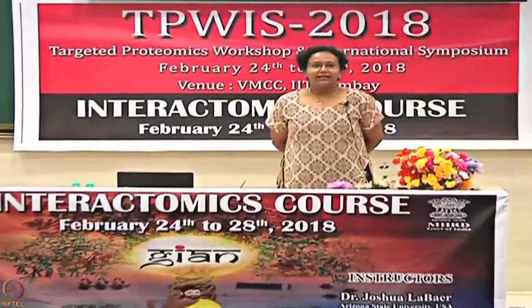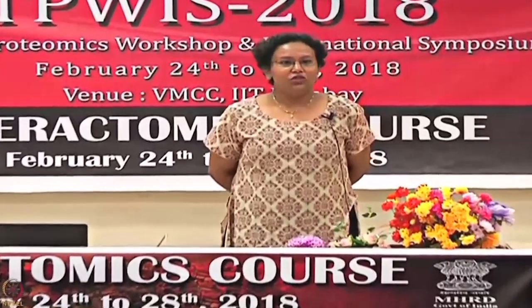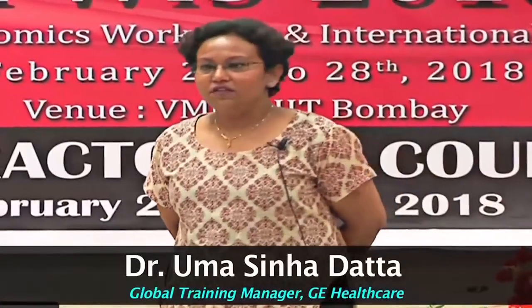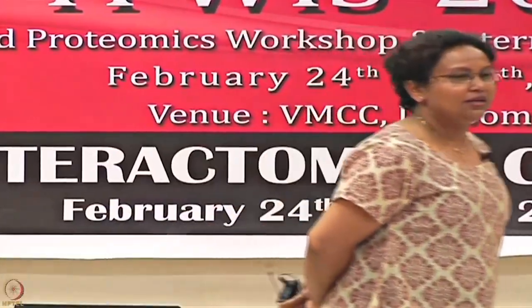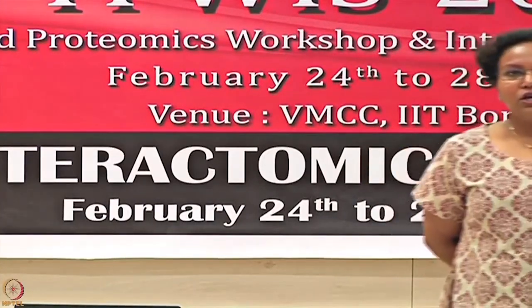So, you all had a chance to look at the Biacore. We talked about some of the SPR technologies, how it actually determines the interaction based on surface plasmon resonance technology, right? You know what the association phase is, what the dissociation phase is, and that regeneration is required to run the cycles.